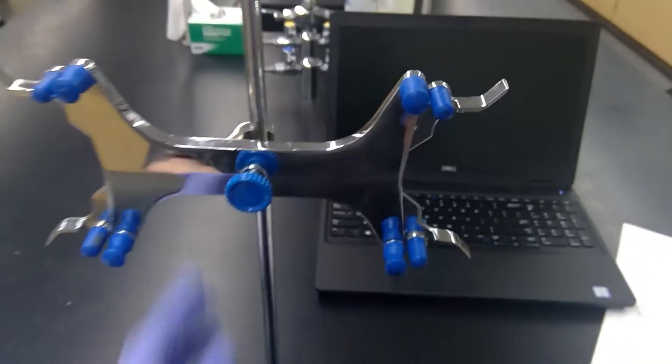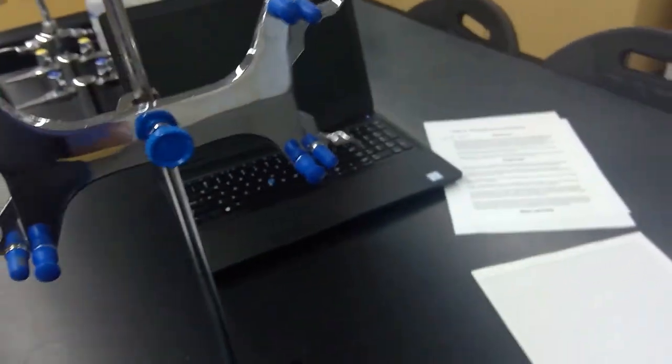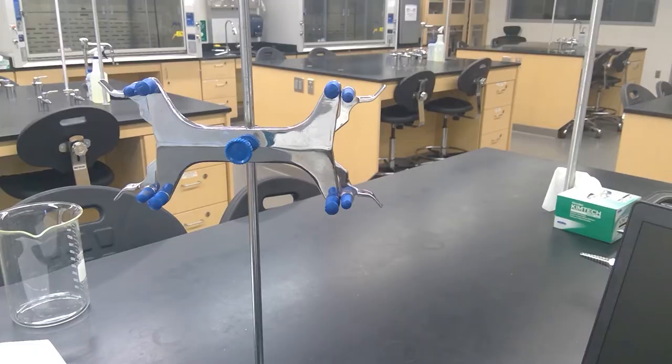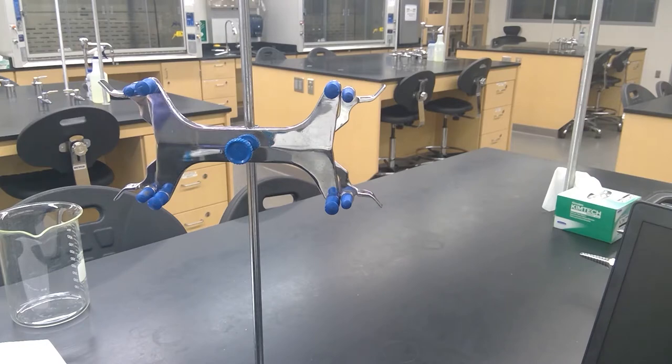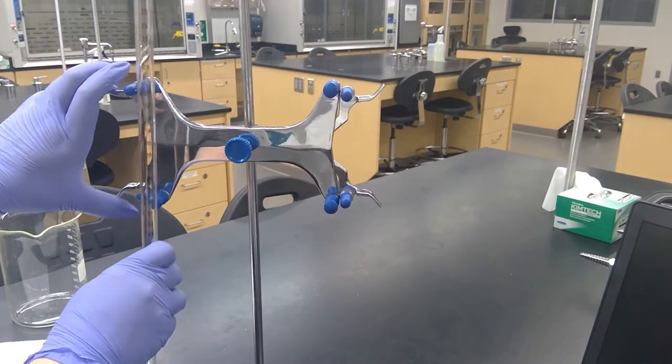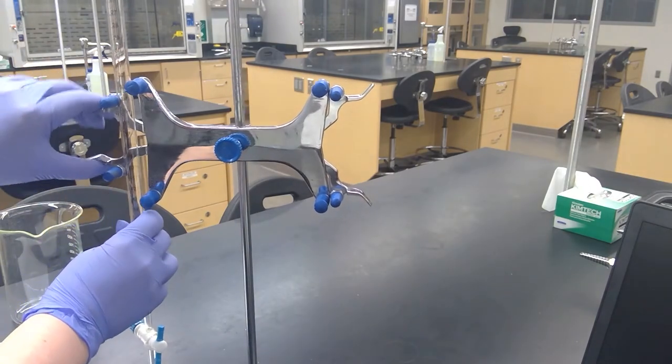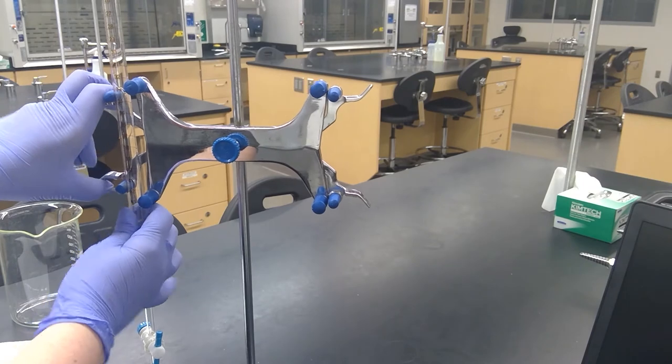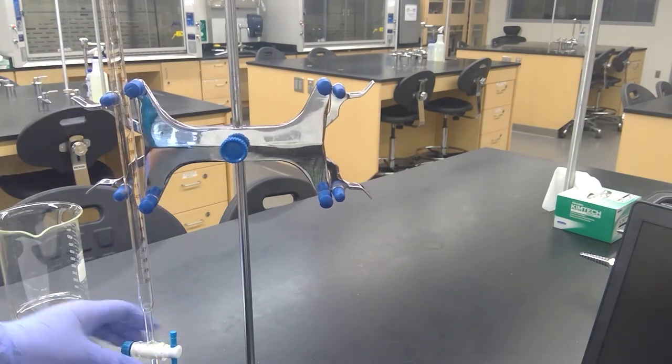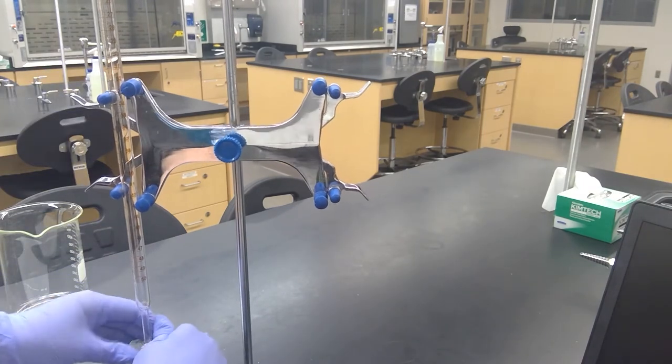The burette is at the instructor bench, and then you will have a stand and a burette holder at your table. So I'll go grab a burette. Let's put it into the holder. You'll want to make sure that it's in the closed position.